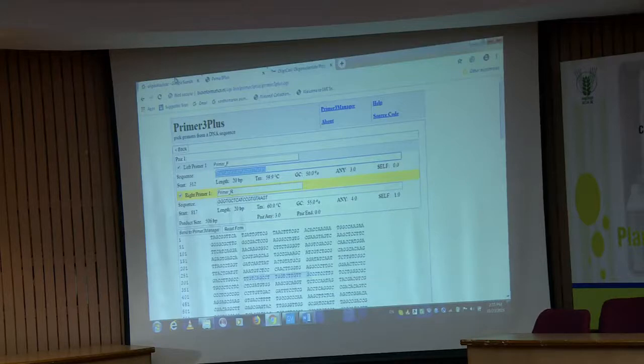Those primers we are using are universal primers, although we want to check the variability among the organisms, and only then can we make out which bacterium or which fungus it is. The primers which we pick are universal primers, because that sequence is conserved among the bacterial species and genus, and the species is given based on the variation in that particular amplicon, correct? Any other questions?